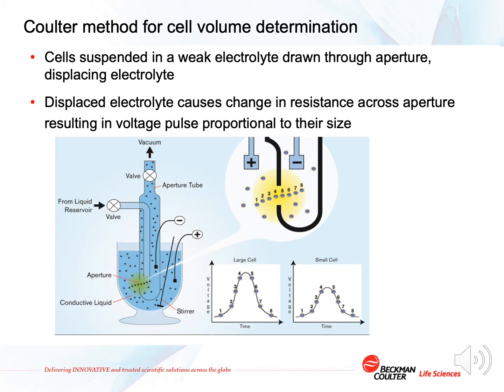The Coulter method provides a very precise understanding of cell counts and cell volume. In order to employ the Coulter method, one simply places their cell suspensions in a cup containing an isotonic solution, and then places the cup in the instrument. The instrument then aspirates a defined volume of liquid through a small hole in a glass tube. Each time an object blocks the hole, a voltage pulse is measured that is proportional to the size of the object. The instrument is able to measure several thousand cells or other particles per second, and therefore provides very nice statistics of the size distribution of cells or other particles in the sample.